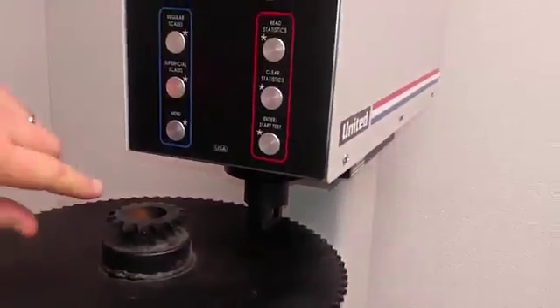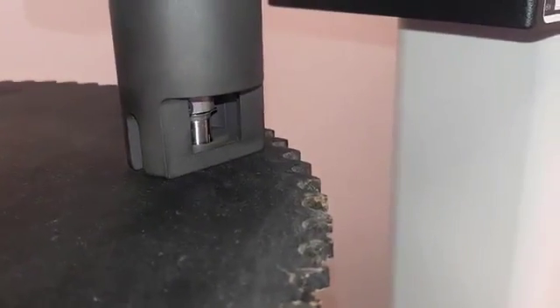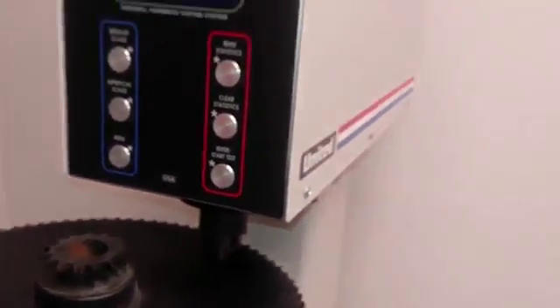We have the machine set to the A scale. I'm going to use the test button to activate the test. The indenter comes down through the clamp, touches the part, retracts, and you're done.